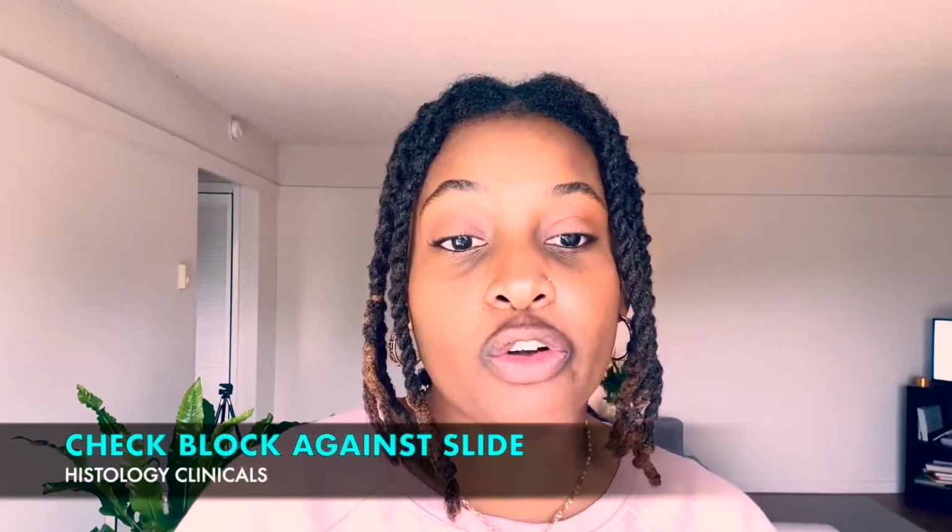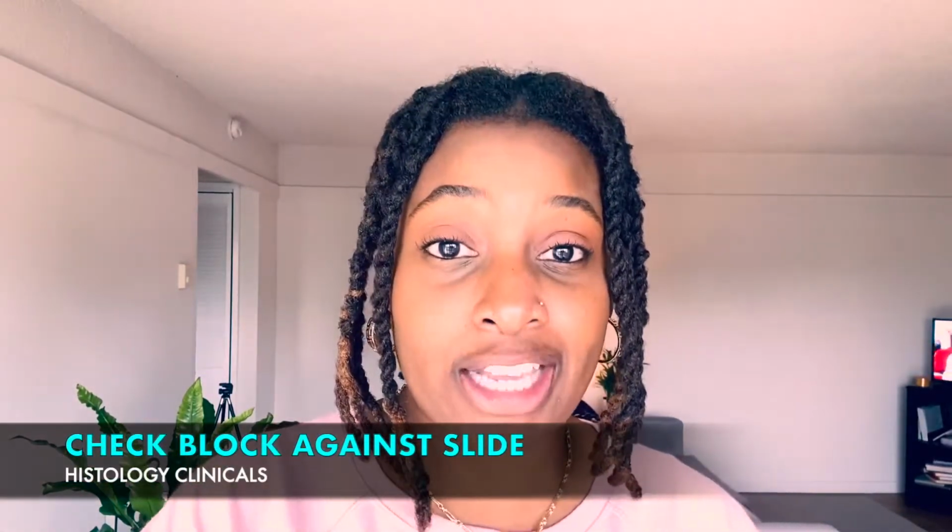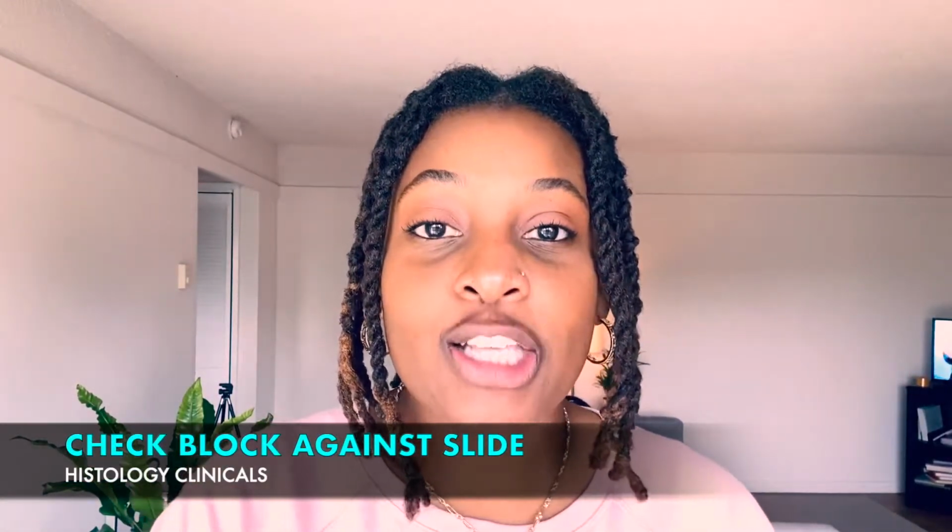When it comes to putting your cases together, there are a couple of things that you need to make sure you focus on, which are really important and will help you in your histology journey. The first thing is, whenever you are putting your cases together, if you have the opportunity and you can have the blocks there with you, especially while you're training or in school or maybe on your clinicals, if you can just flip the block over to double check that the slide matches the block, that is really important.